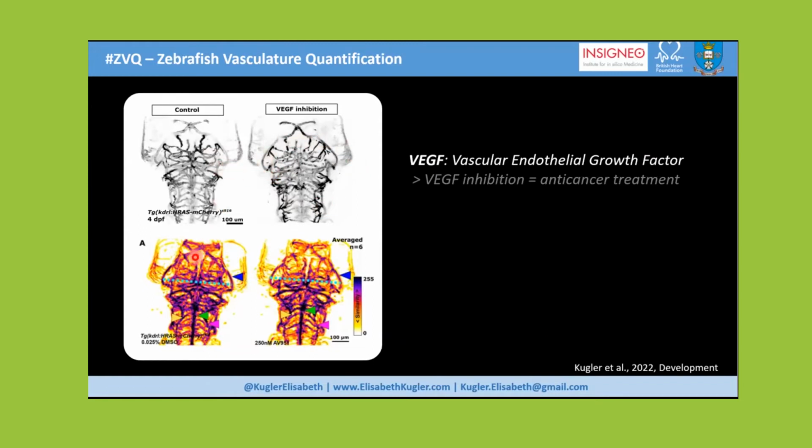So we then produce these population average maps where we have 6 different samples averaged against each other. And this is again control and your treatment fish, and just by looking at them you already see there isn't really a lot of difference, or at least there's nothing that strikingly, obviously jumps into your face saying, oh, this is the vessel that has been changed.